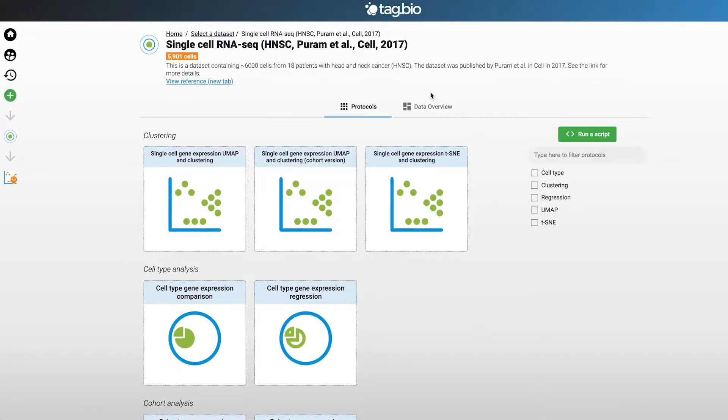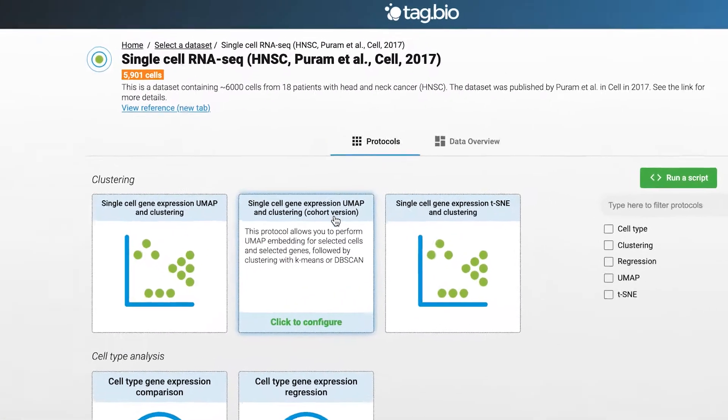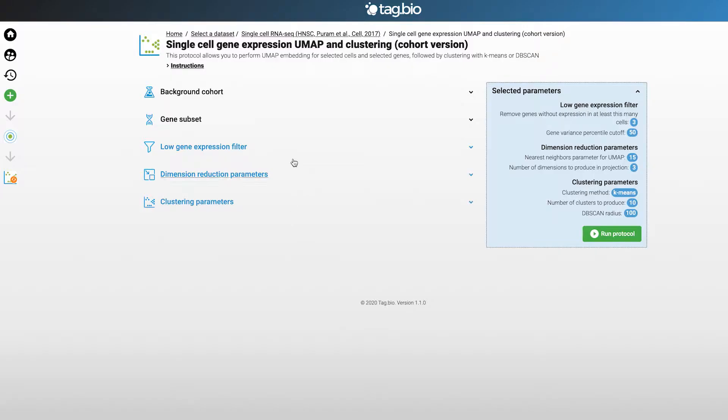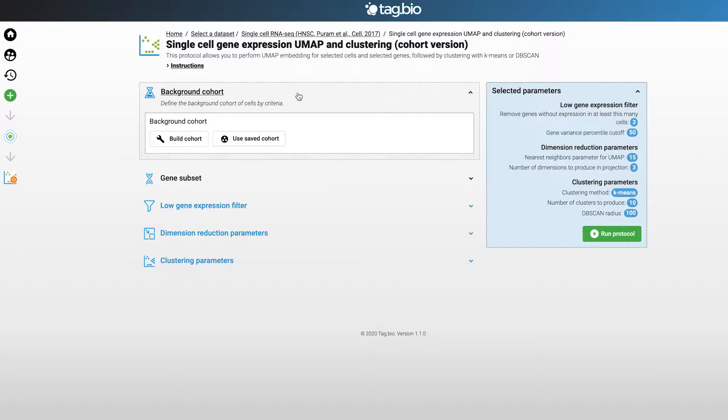Then we're going to select an analysis app: single gene expression UMAP and clustering. For this particular app, defaults are set for your convenience but you can change them if you want.